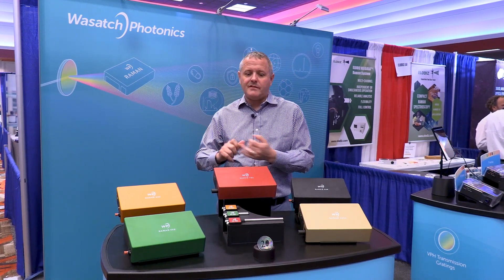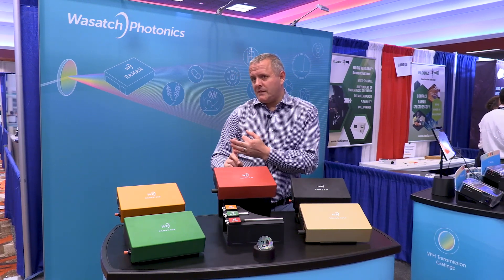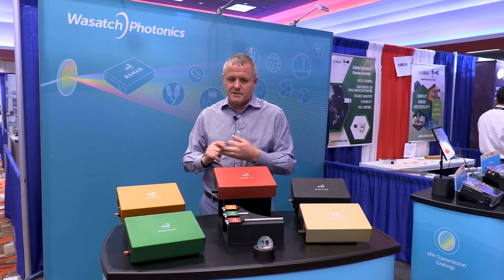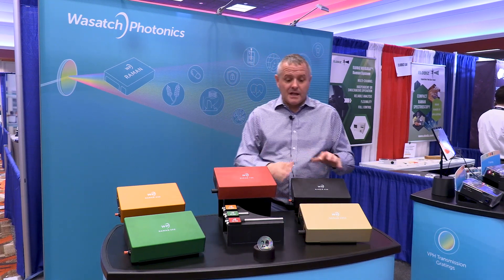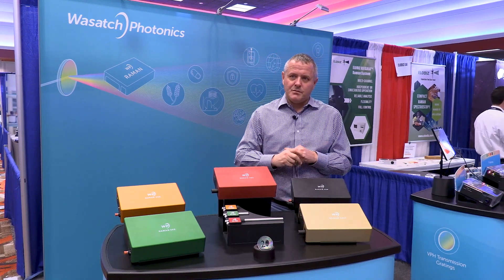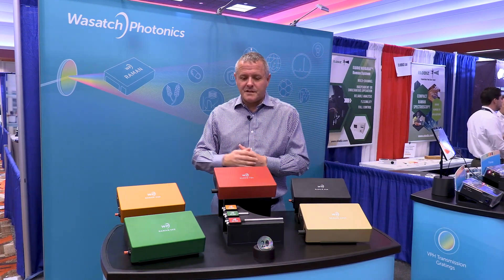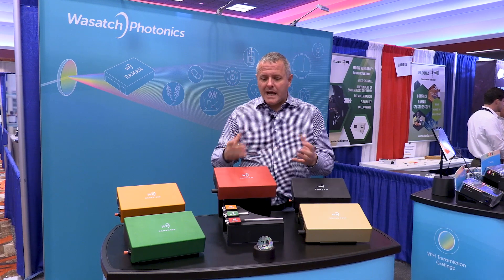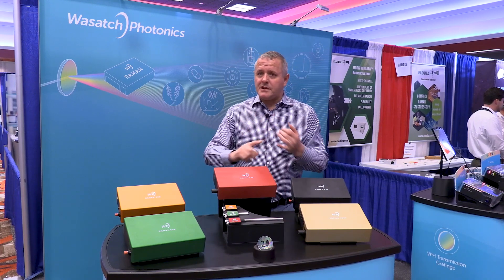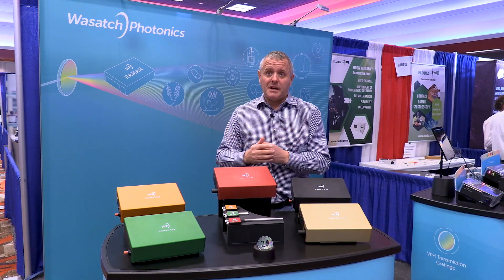Being sensitive and having configurability is important, but we also need a couple of other things — and that's where design for manufacturing and volume manufacturing come into play. In order to take the same measurement on every individual spectrometer, it's really important to have high unit-to-unit reproducibility and thermal stability. What that actually means for people using these instruments is that they can trust the data — their library matching, chemometrics, and principal component analysis — they can trust the answers coming out.